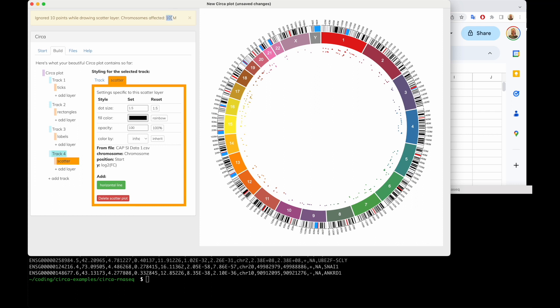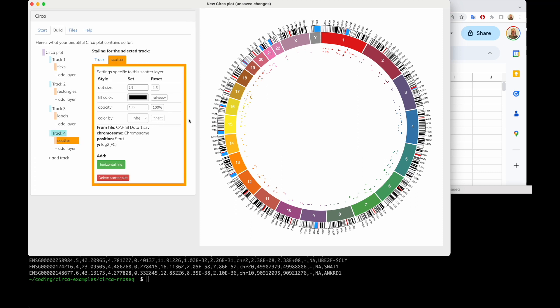Note here that it says the mitochondria data points are not shown, and data points on chromosome 10 might be missing. This is probably because there's a data point that might be outside the size of chromosome 10 — maybe this is GRCh37 data. Just something to look out for when you see these if you don't want some of your data to be missing.